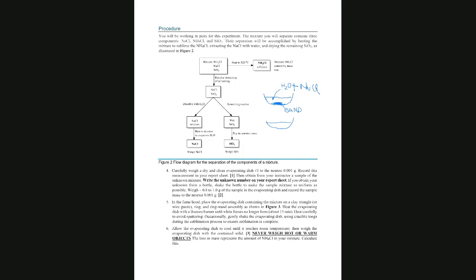So you're going to have them in two different places. You're already separating. But what happened with the sodium chloride? You have it in water. You want to have the solid. So you only have to evaporate that and then take the weight when it's dry of the sodium chloride. And then you do the same with the sand. The sand is going to be a little wet because you added water, so you dry to constant mass, and you're going to take the weight of that.